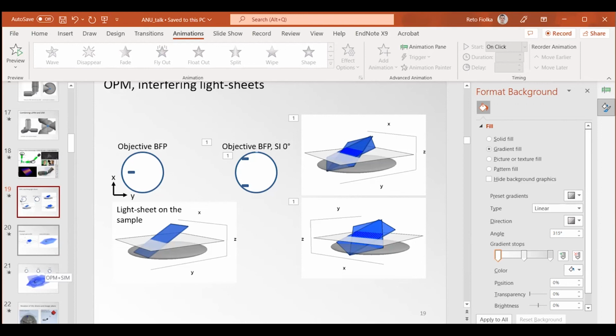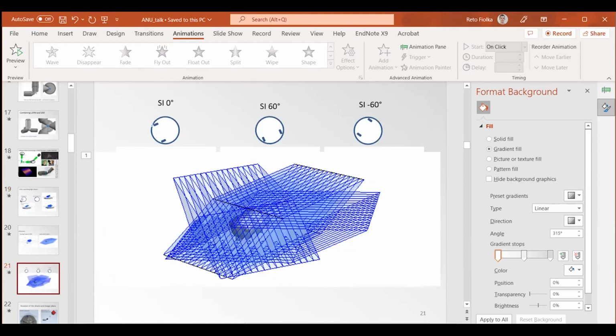So that's the beauty. If you have them somewhere where you want them and everything is correctly aligned, it just rotates them. If it's not correctly aligned, maybe one of your orders will jump over the edge and disappear.